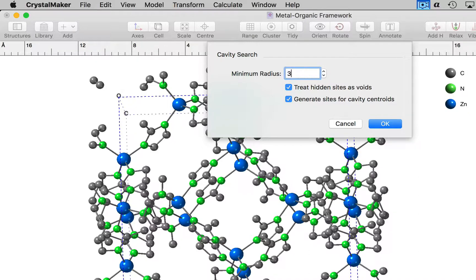We have the option of generating sites for the cavity centroids.